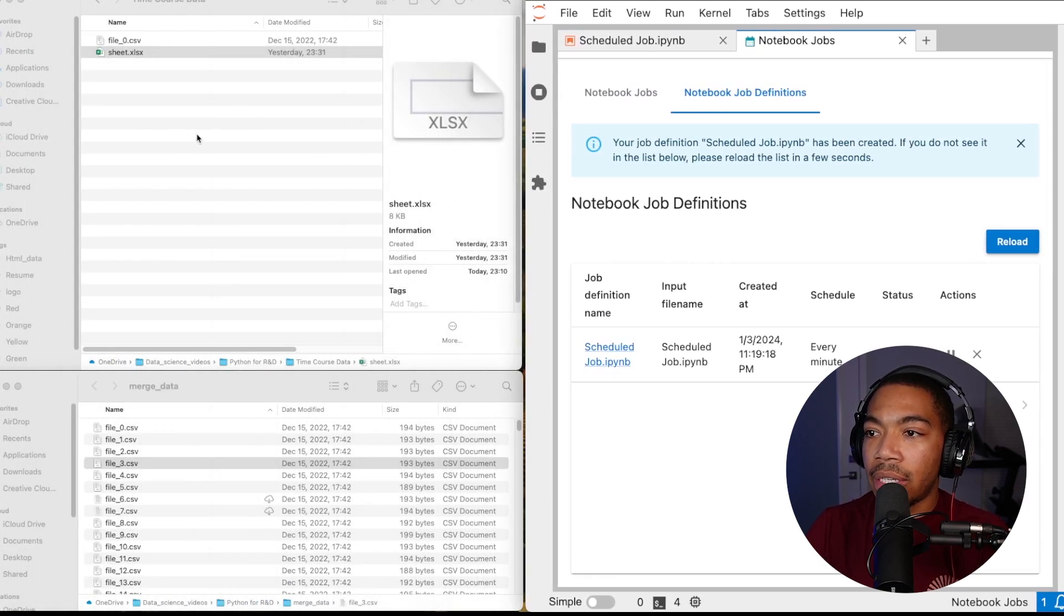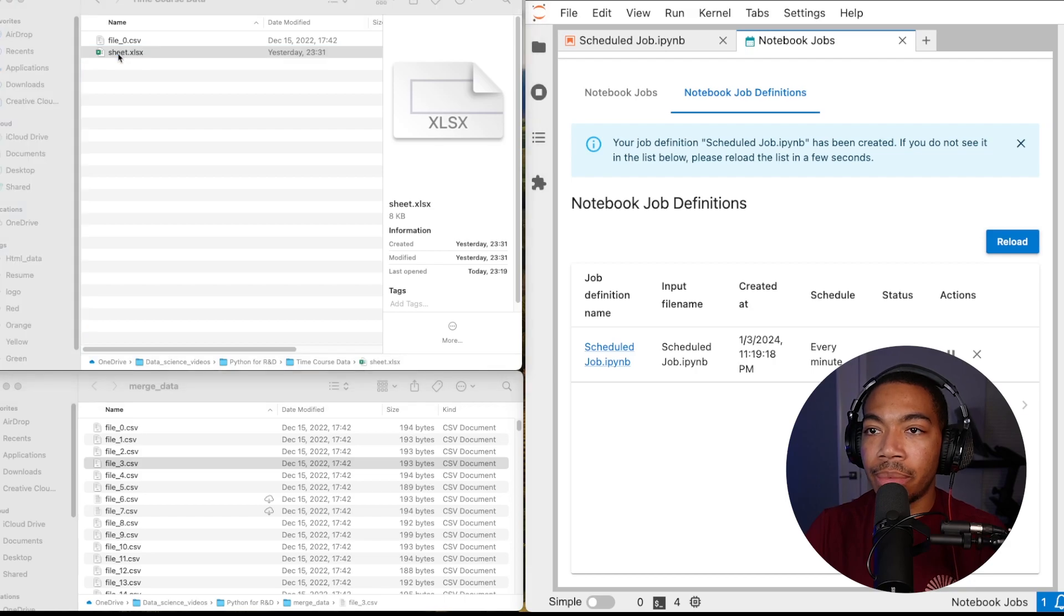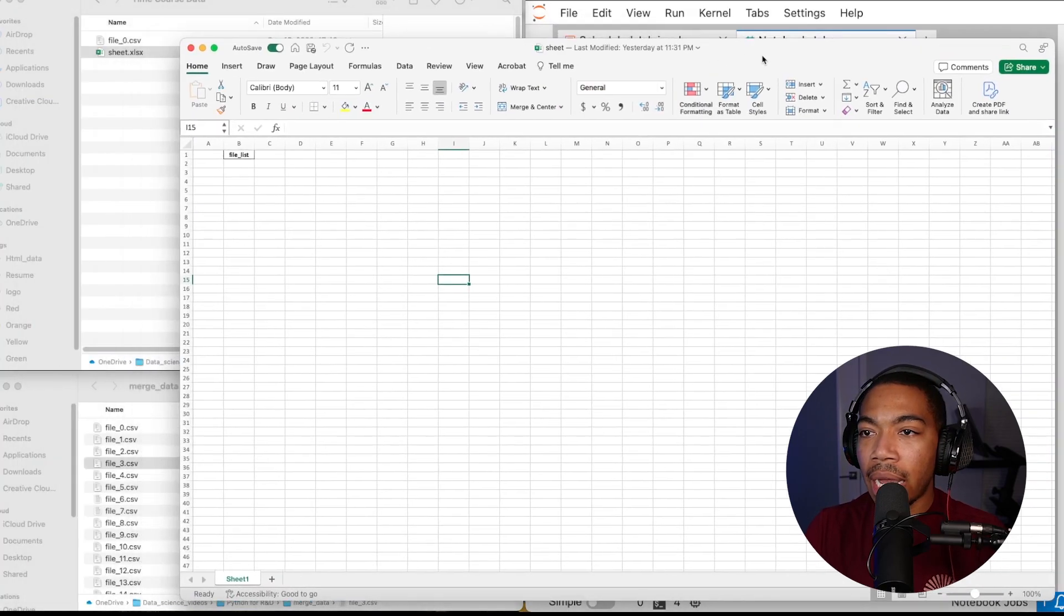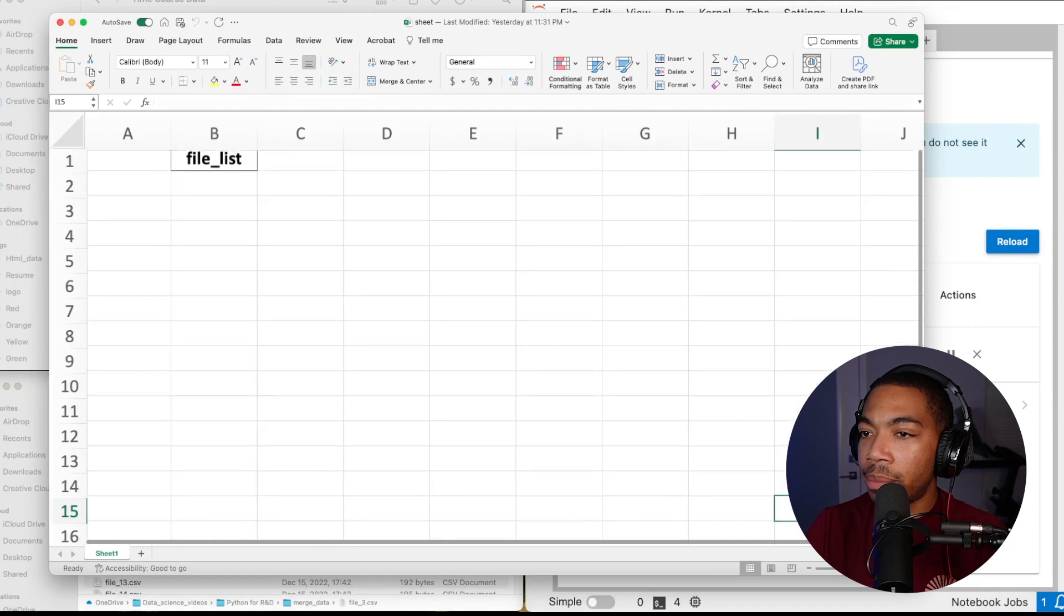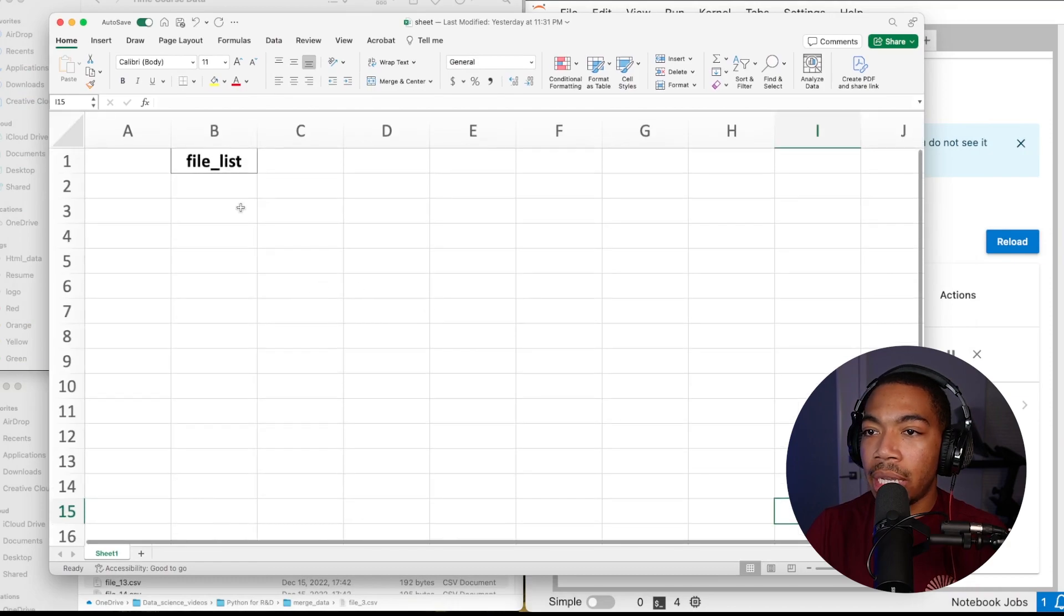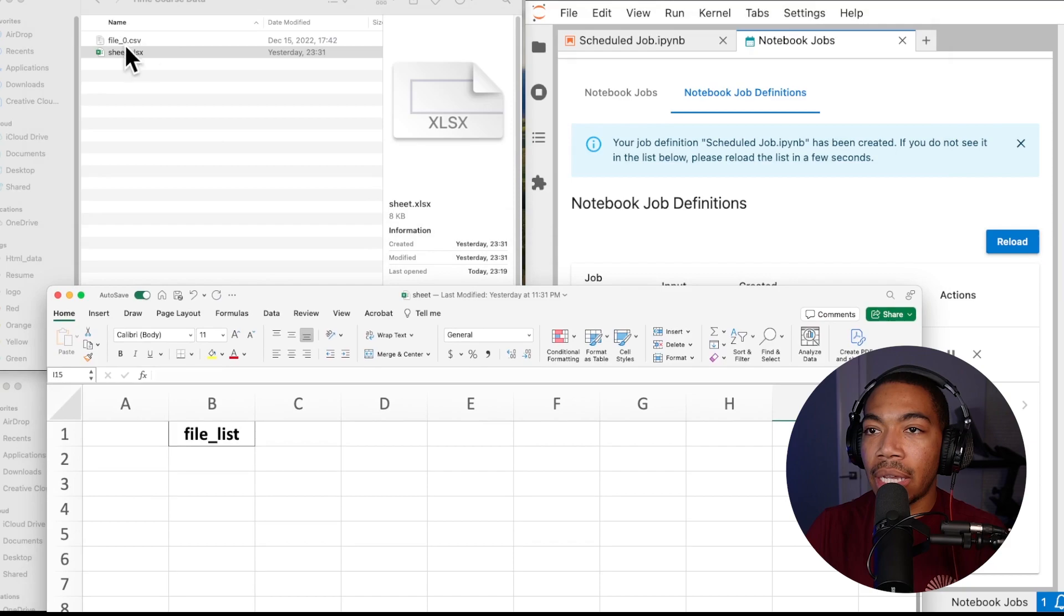So here we have it, this is our sheet we're looking at. Now let me show you where we start. Right now this file list is empty. If we zoom in here you see there's no file here even though there is a file in this folder.